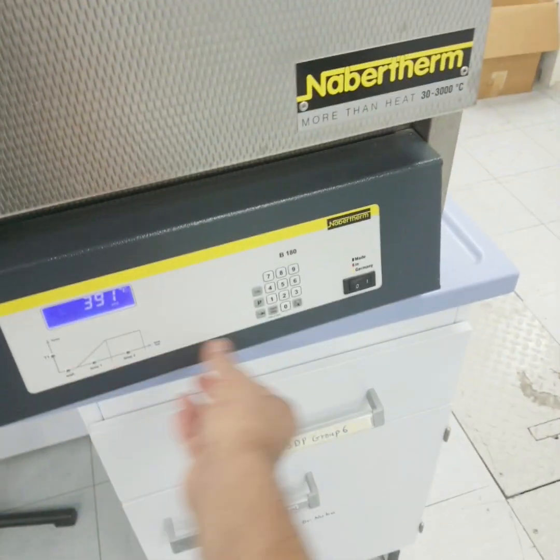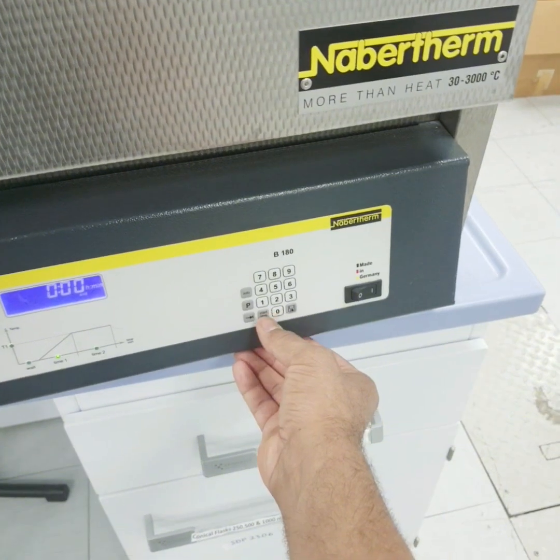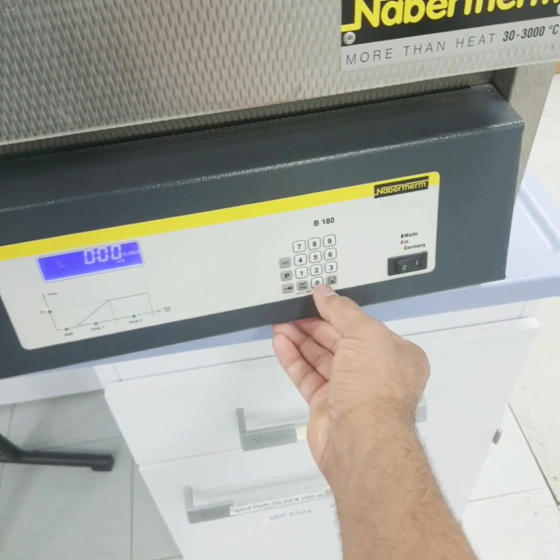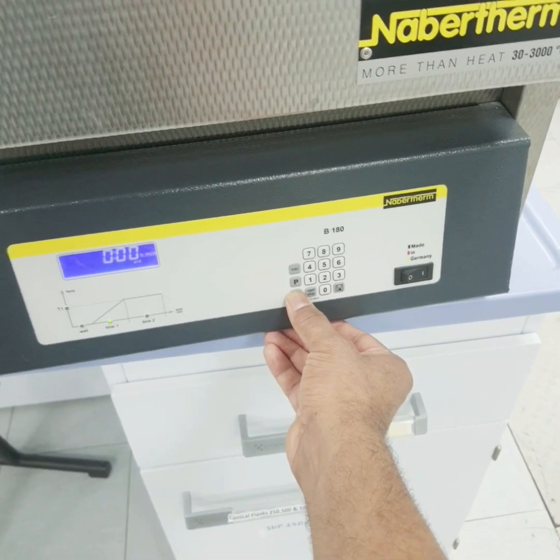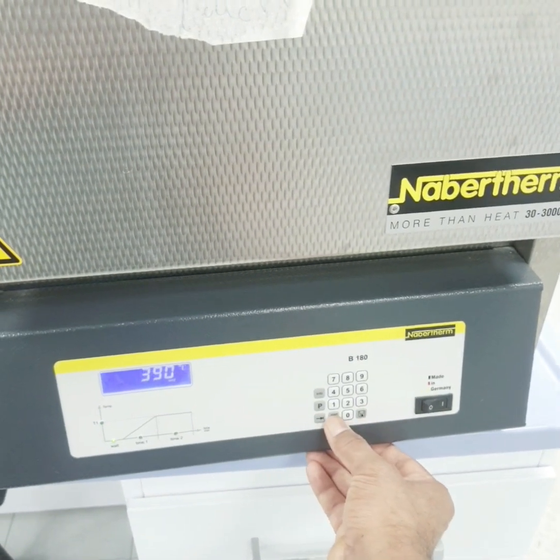Placing this, we have to set the temperature. We would keep the time as 0. Now the temperature should be 600, and then it should be 2 hours. Okay, now we'll start.